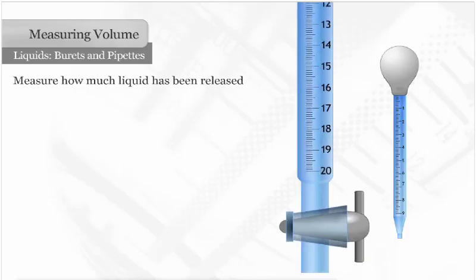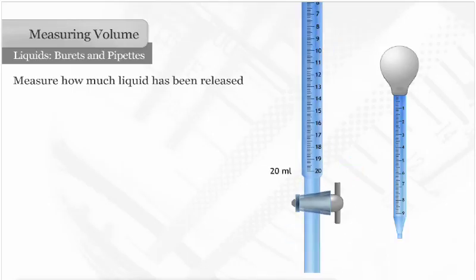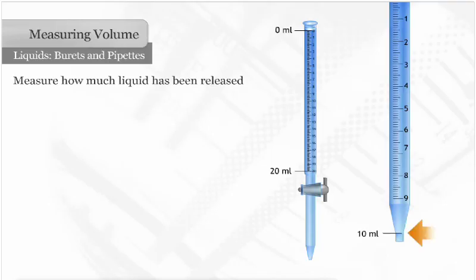This burett is used to measure up to 20 milliliters of liquid, and this pipette is used to measure up to 10 milliliters of liquid.